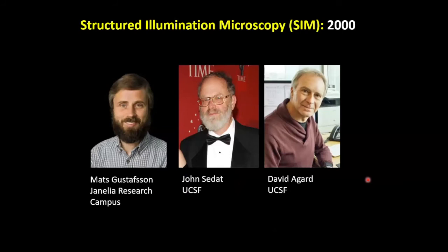Another super resolution technique is the so-called structured illumination microscopy, first introduced in the year 2000 by Gustafsson, and unfortunately he passed away in 2011. Therefore, he didn't win the Nobel Prize. I'm not sure if he would have been considered for the Nobel Prize for super resolution technique or not, but unfortunately he passed away. Together with John Sedat and David Agard, he first announced this idea of structured illumination.